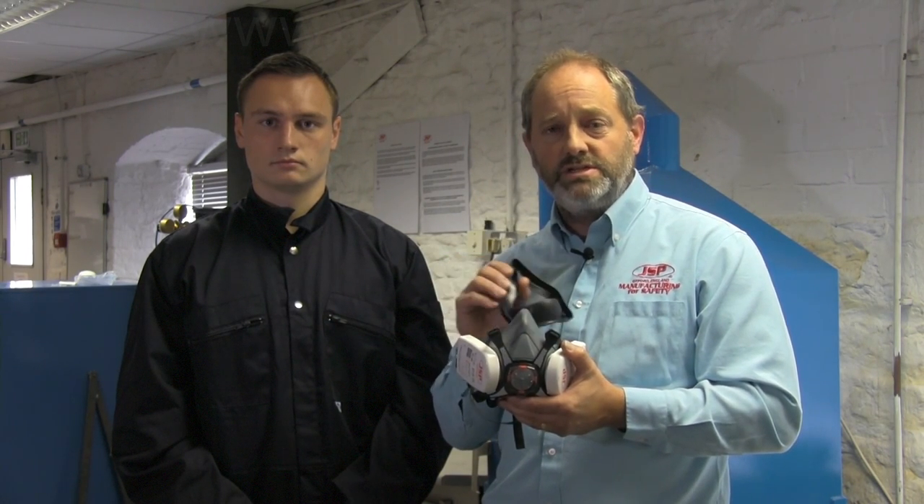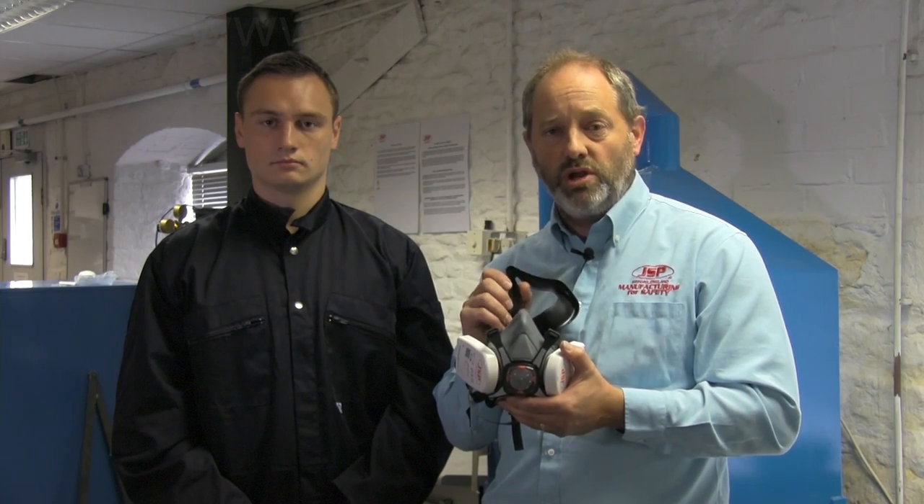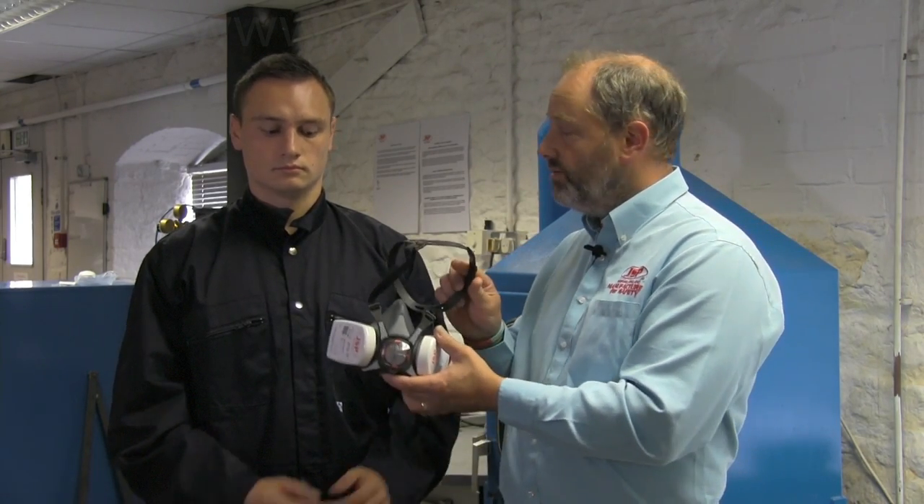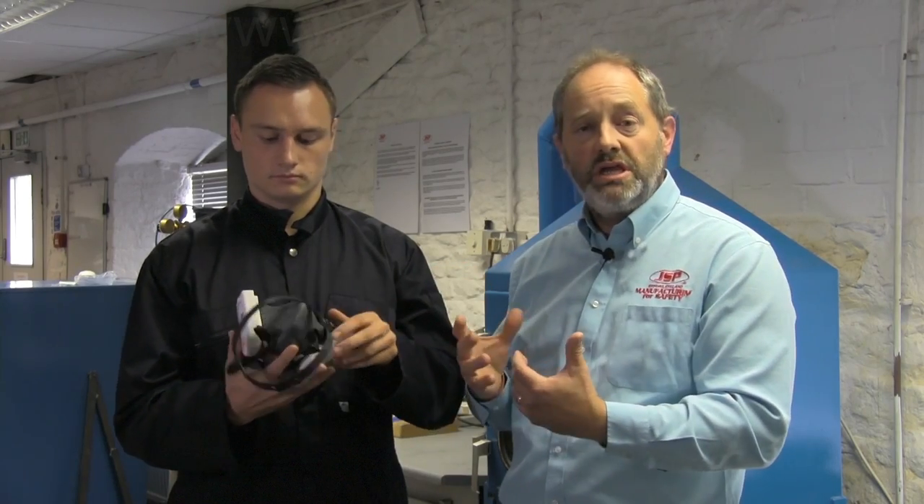So to fit the mask, first of all we need to remove the transit and storage packaging for the face seal. This helps protect the face seal and prolong the life of the mask. So what we're going to do is give the mask to Joe and ask Joe to don the mask in the normal way.